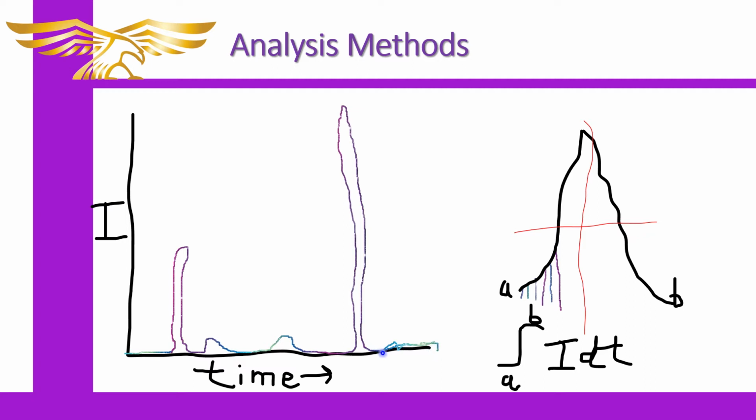And then over here, this would be what you would call signal-to-noise ratio perturbance, or just noise. It's not really necessarily a peak. It could be a contaminant in some cases, but that's probably just noise from the instrument. All instruments have a little bit of noise, and the key is to do enough statistics so that you minimize the noise and increase your signal.